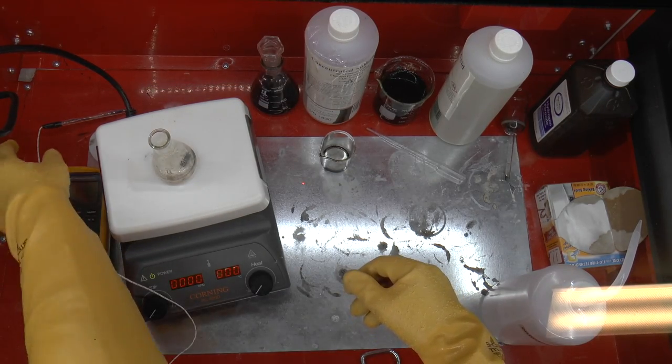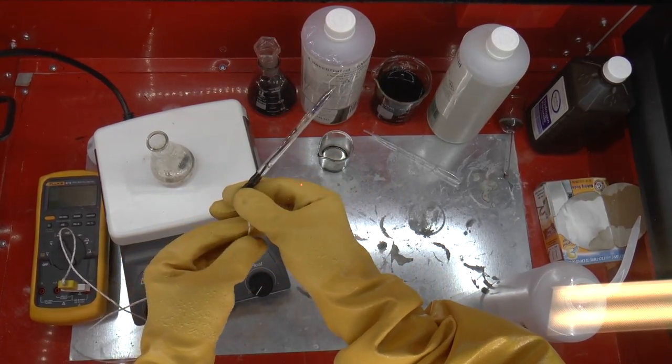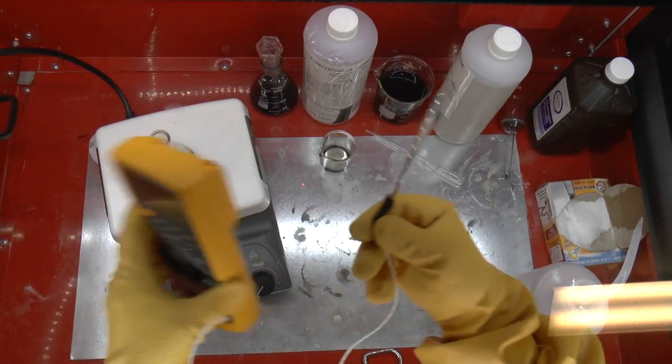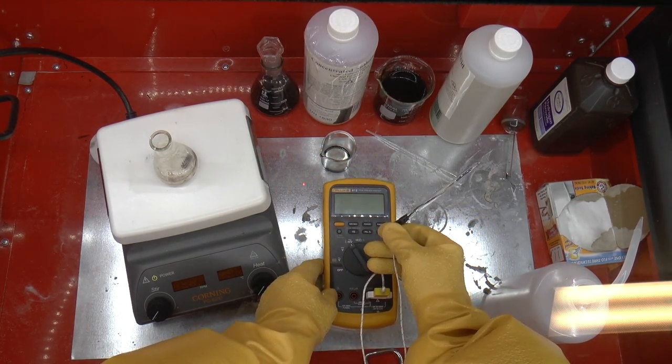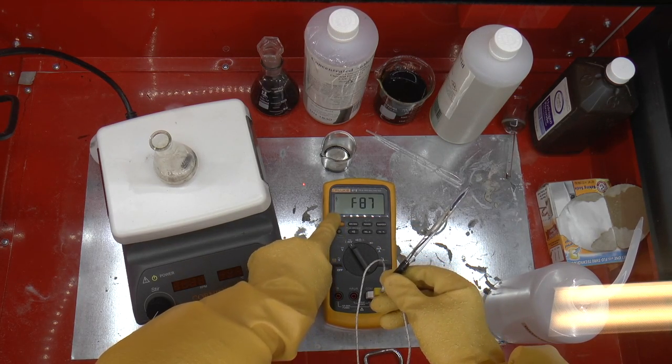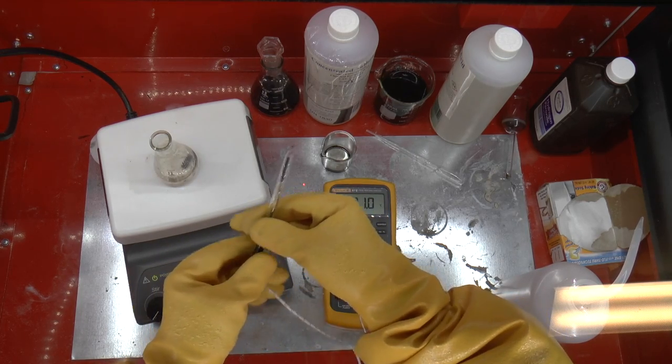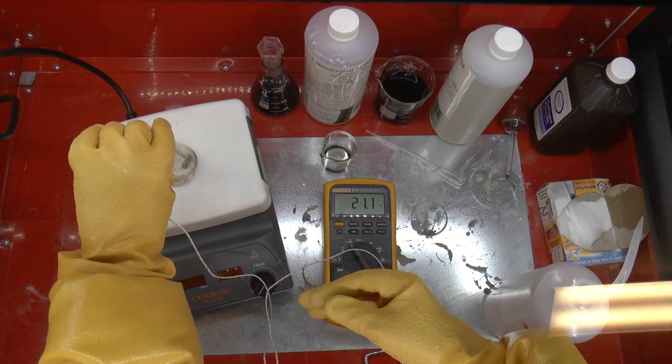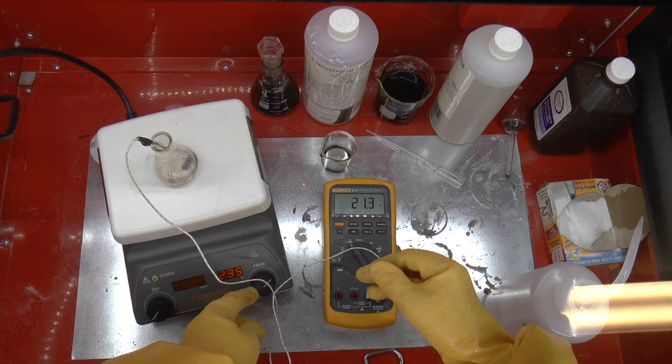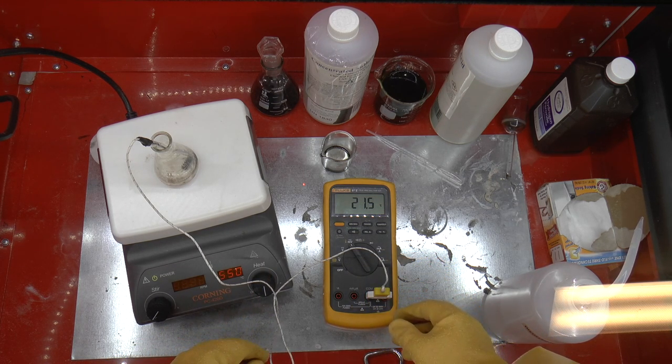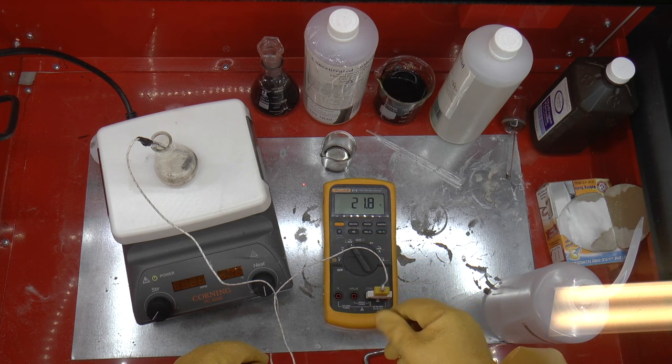I have this temperature probe that I made after the one featured in NerdRage. It's basically just a glass pipette with a thermocouple in it, and I've hooked it up to my Fluke multimeter. Now I'm measuring the temperature in Celsius. It's 21 Celsius. I'm going to put it in the beaker, turn on the hot plate all the way up, and go all the way up to 200 Celsius.